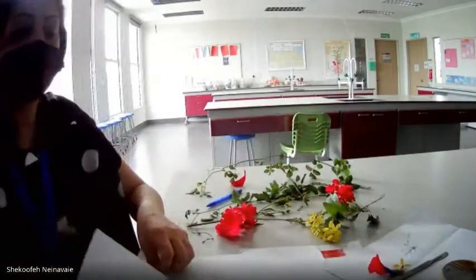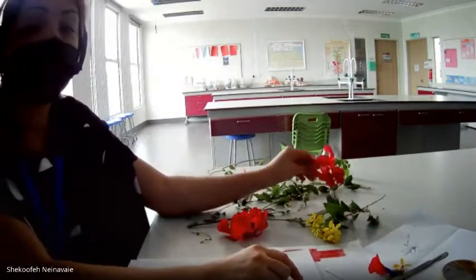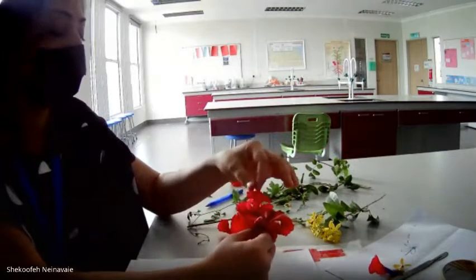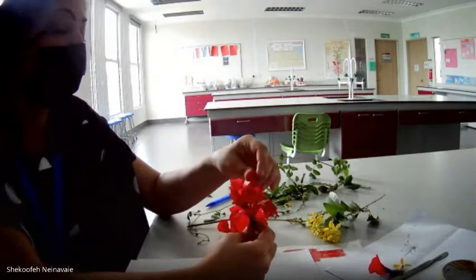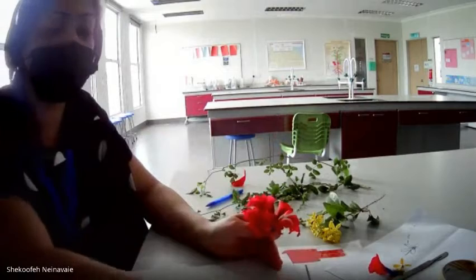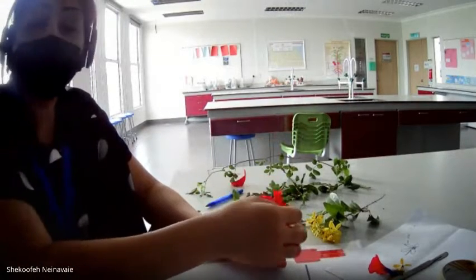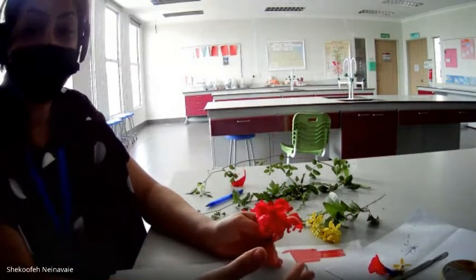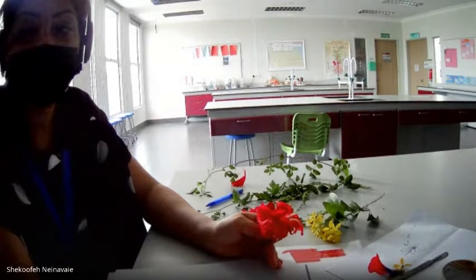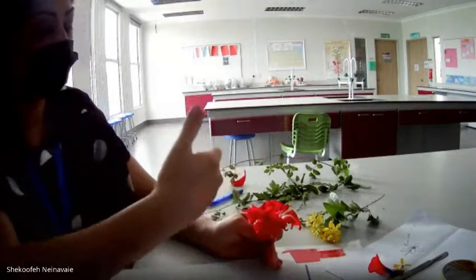So I want to teach you how to first collect your samples. I have collected my samples early in the morning, but sometimes you cannot take the samples with you. One of the best things is that you just sketch and take those details of the flowers that are needed. You don't need to be an artist, as I told you. The only thing necessary is to pay attention to the details, anything that you see on the outer part of the plant.